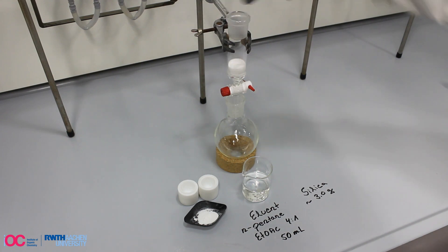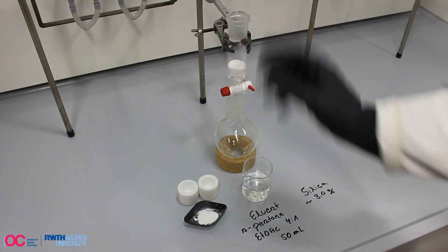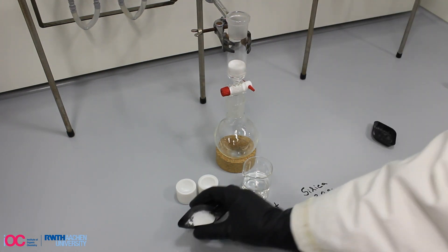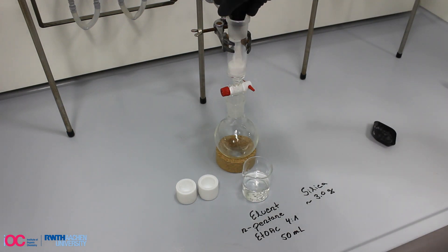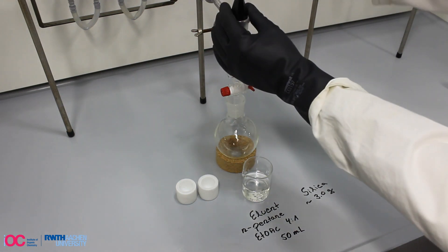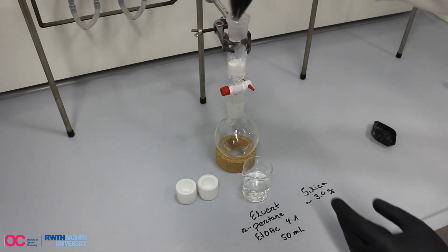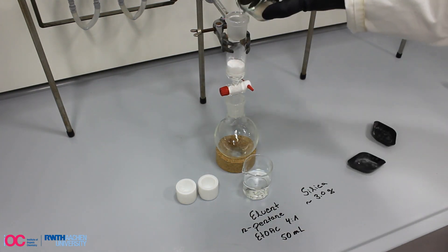The purification of the desired sulfonyl fluoride can be achieved by simple silica plug filtration. First, 3 grams of silica are added to the column, followed by the crude mixture obtained after the milling process and a small layer of sand.